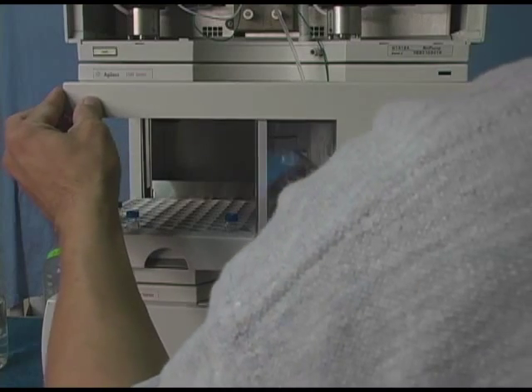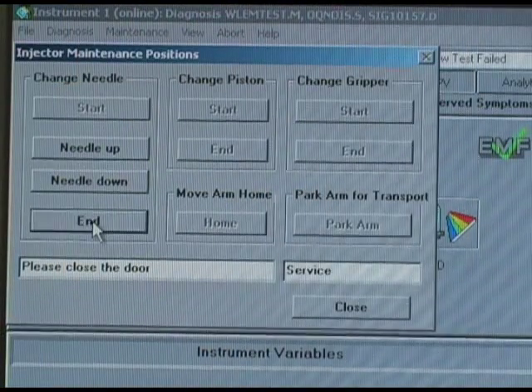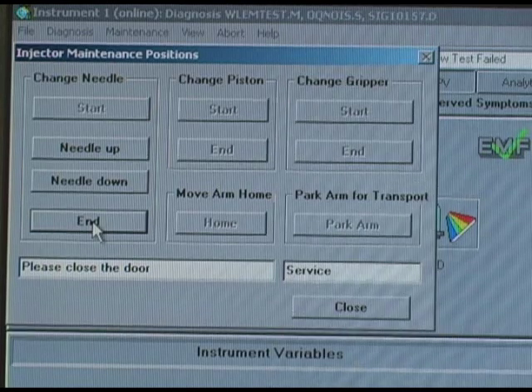Finally, you're going to replace the Front Cover on the Auto Sampler. Go back into ChemStation, click on the End button, and that's it. You have successfully changed the Needle in your Agilent 1100 Series Auto Sampler.